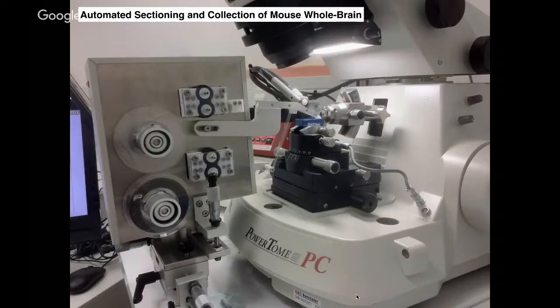Now, when I first attempted this, I explained to the people selling me these machines and other ultramicrotomists what I was intending to use their machines for. And the old school ultramicrotomists were just giving me warnings that something terrible would happen if I tried to actually cut through a centimeter size sample with these ultramicrotomes. This didn't discourage me at all, but actually got me quite curious to find out what would happen if I seriously attempted this. So, of course, I went ahead and did this.